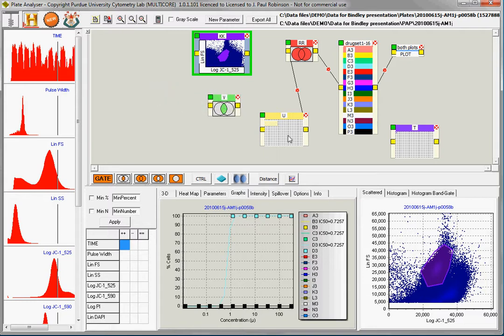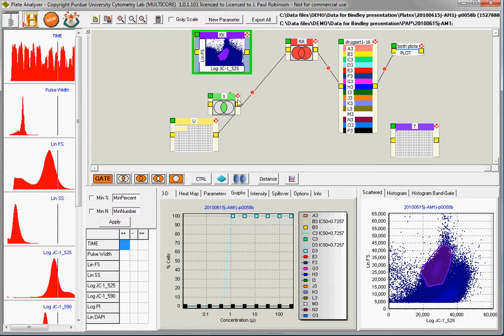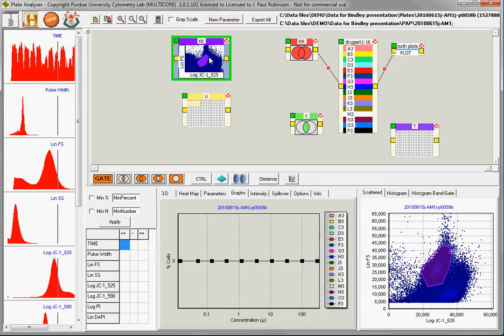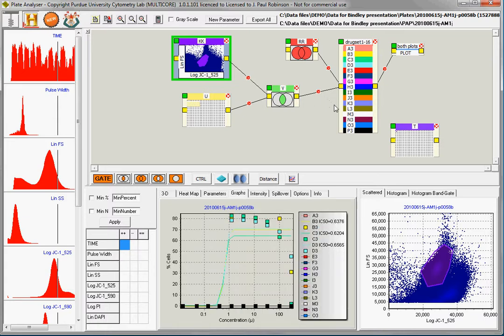requirements that they be in both populations. So here I've got now a gate that says you have to be in there and you have to be in there. And if I join that to that, now I've got these cells and these cells. Only those that are in both populations, etc. This would be neither and or. Okay. There's another gate that I can make.